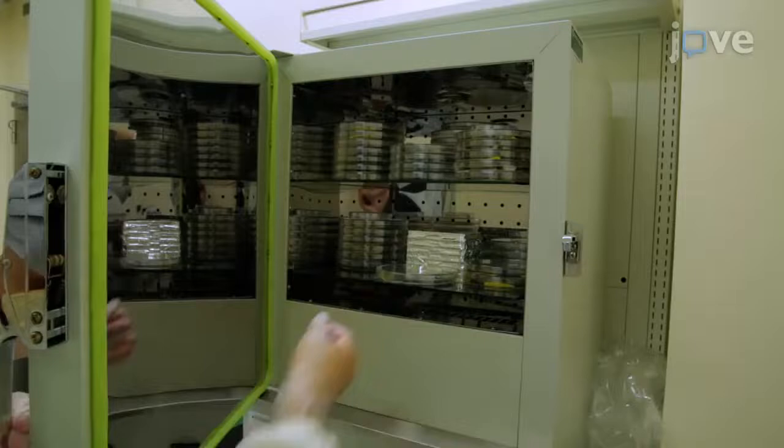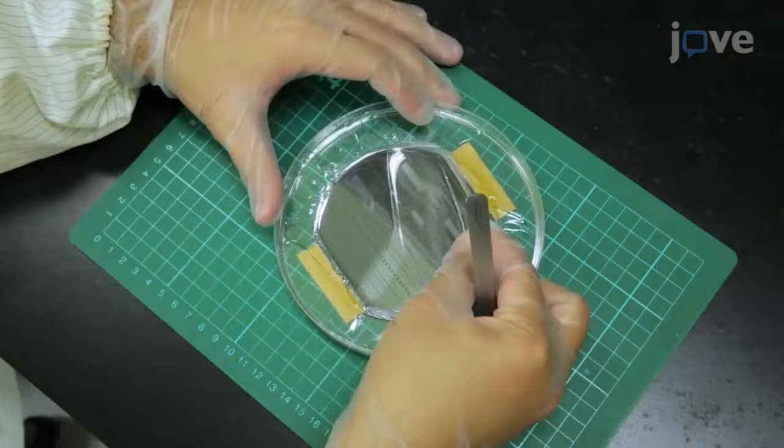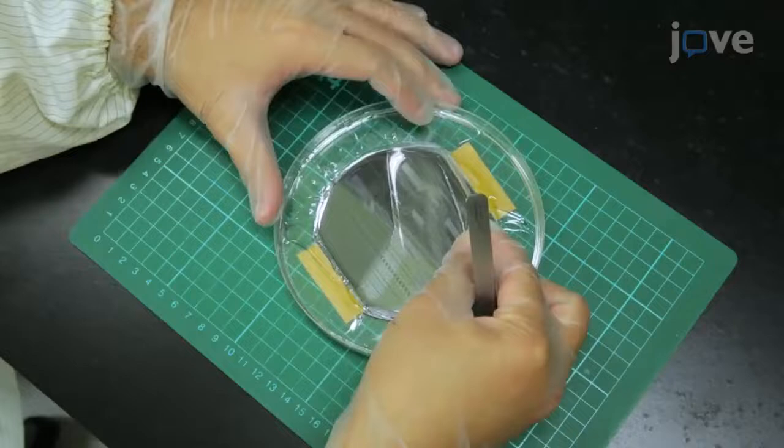Cure the PDMS by placing the dish in an oven at 65 degrees Celsius for 2 to 4 hours. When finished, remove the PDMS replica from the wafer mold and punch a 1.5 mm inlet and 0.5 mm outlet on the PDMS.